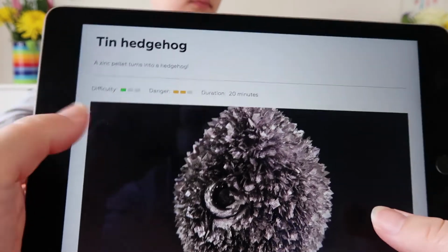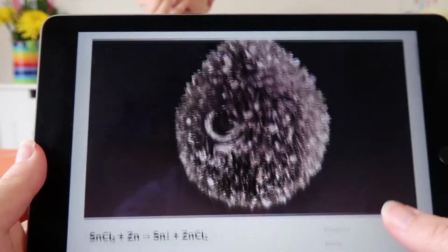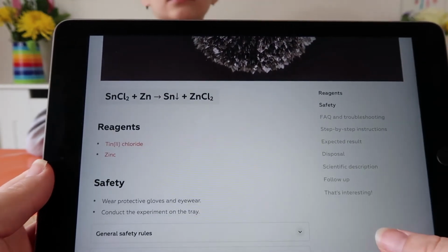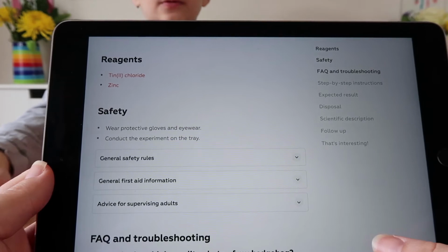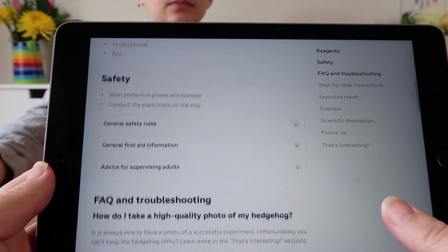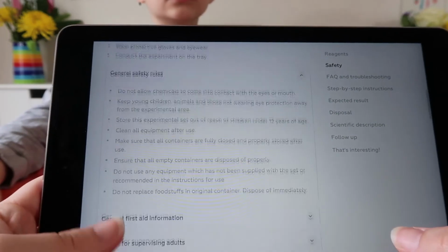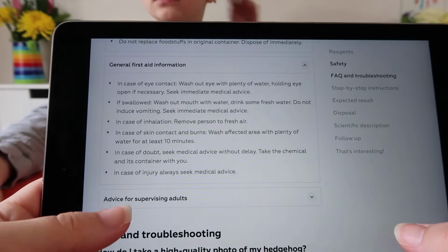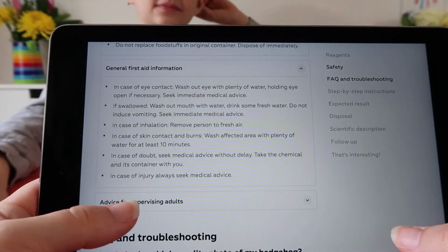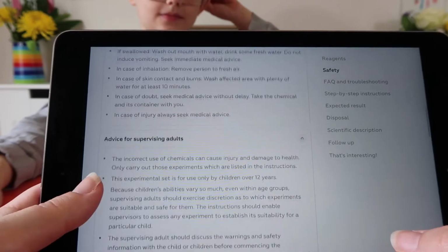This says difficulty easy, danger 2, and duration 20 minutes. So this is using tin chloride and zinc. And it says wear protective gloves and eyewear. Conduct the experiment on the tray. It's got in here some safety rules. It's got some first aid information in case there's any accident whilst you're carrying out your experiment. And then there's advice for the supervising adults.